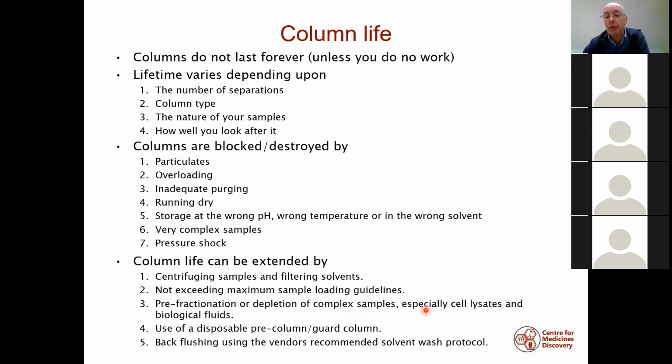This is especially important if you're working with something like a cell lysate or biological fluids like serum. Pre-fractionation, removing some of the compounds that are there in excess, will increase your column life.